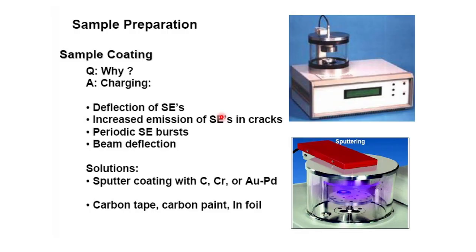So we have already discussed how you should prepare a sample for FESEM. Since we are detecting the secondary electrons or backscatter electrons with the electron beam, the sample must be electrically conducting. That's why this is the sputtering technique. So a gold plate is kept here, and after creating a very high vacuum and providing a very high voltage, that gold nanoparticle will be sputtered on the surface. So here you will put your sample and then make the sputtering to make the surface electrically conducting.